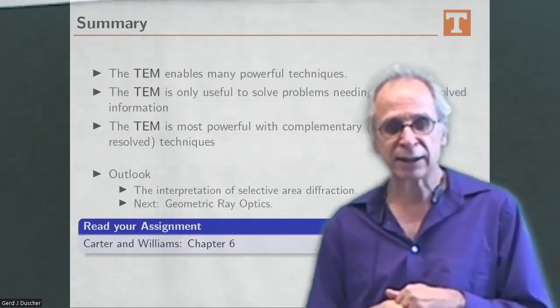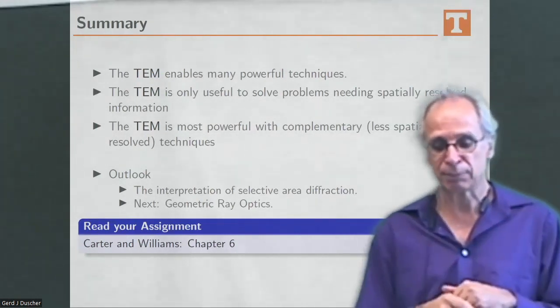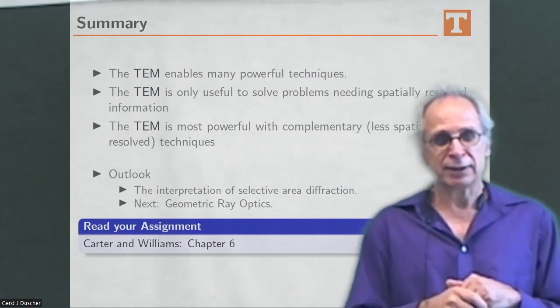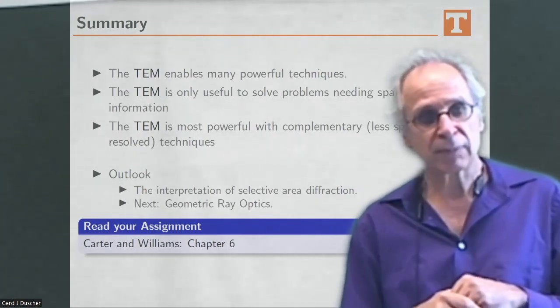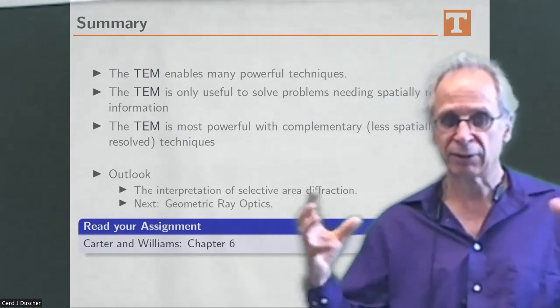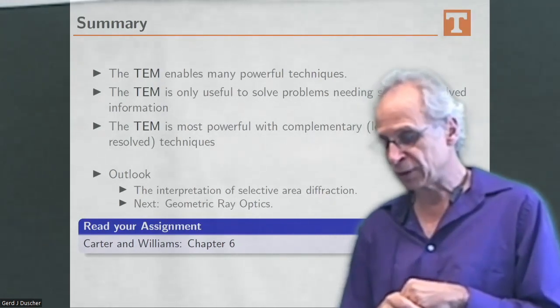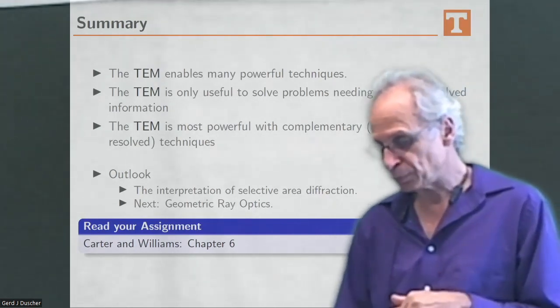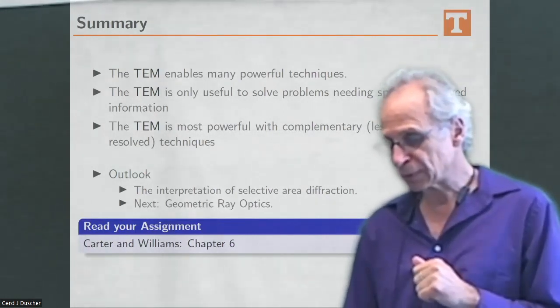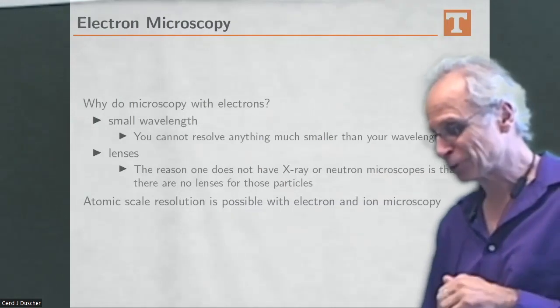So I think another key component in quantitative and future microscopy will lie in the correlated techniques. So you do several techniques, and only if they match, your confidence level will increase. I left that part out from my lecture, so sorry.